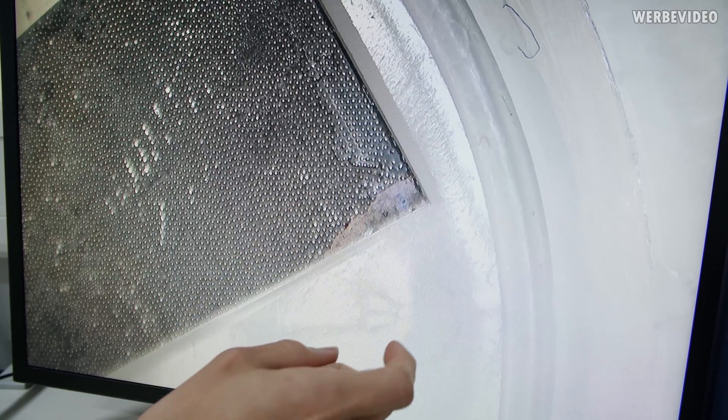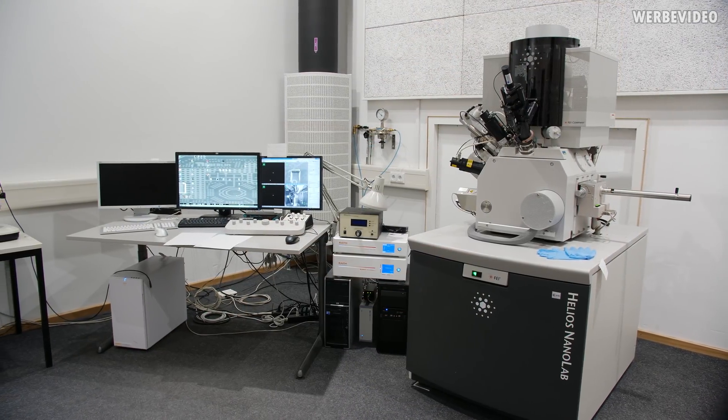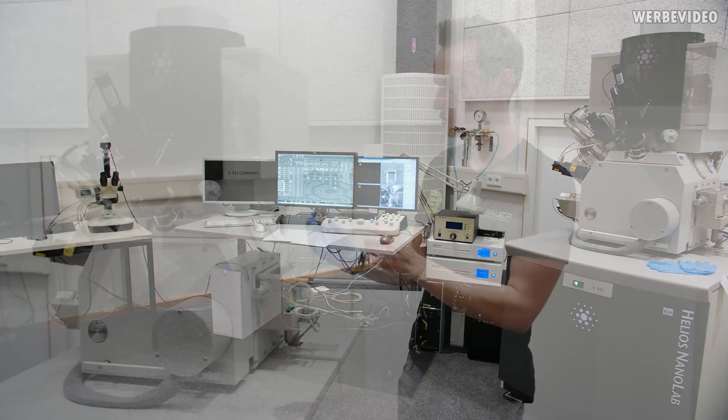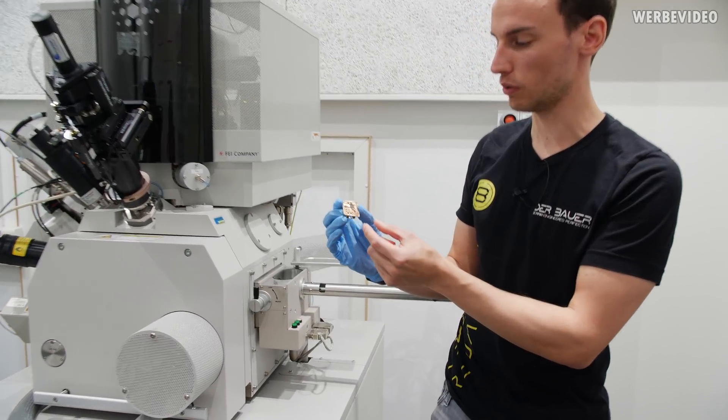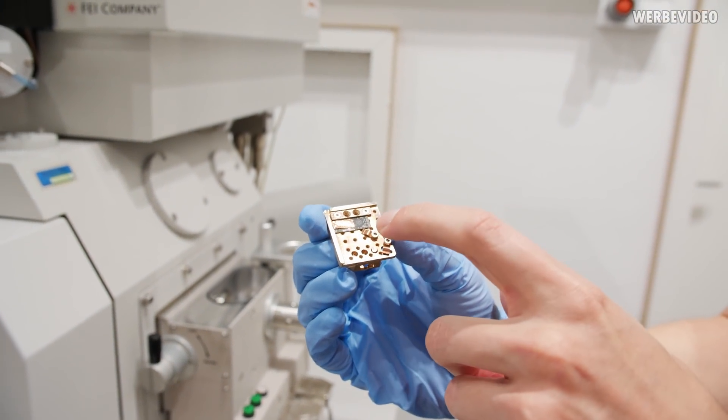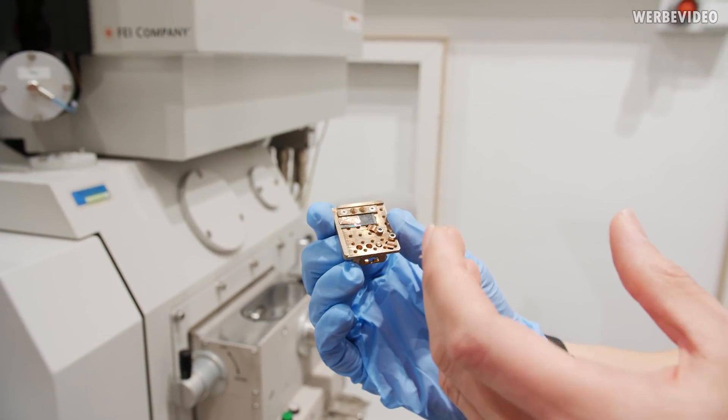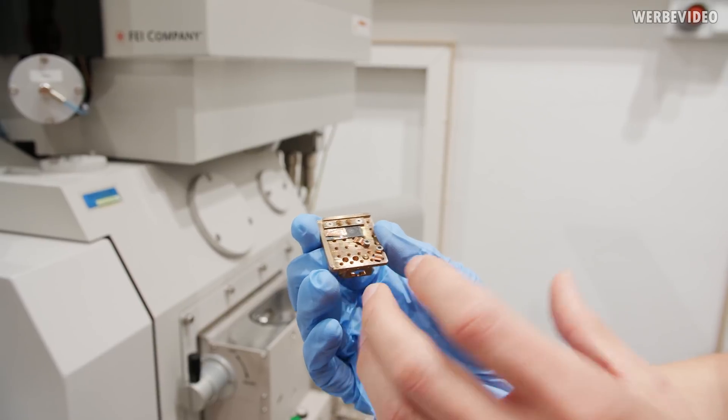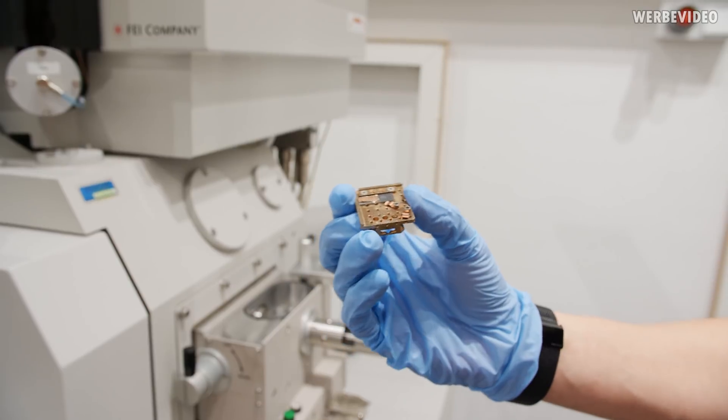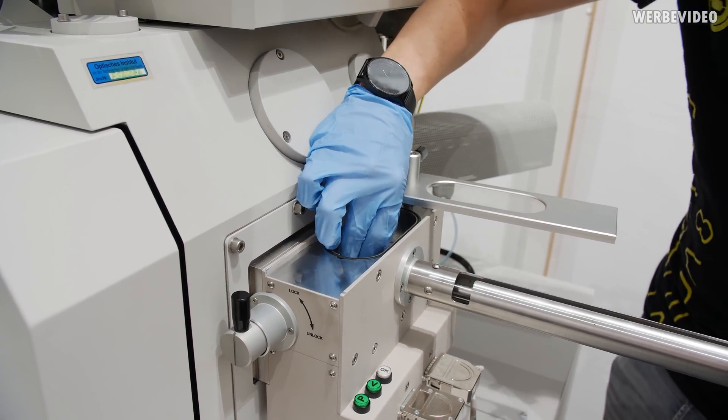We are now standing next to the scanning electron microscope and you can see in my hand I'm holding the Core i9 9900K which is already placed on this small holder. It's also very important that it's electrically connected to the CPU so we have this small stripe of copper tape on here. Depending on what kind of sample you're going to analyze it might be necessary that you're coating it with a different metal to make it electrically conductive. Once it's prepared the sample is placed inside this load lock.